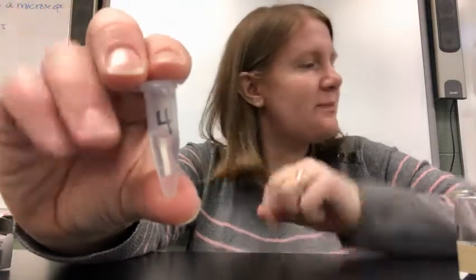Put a little bit of the sample in there. Get some of the testing solution. And invert the test tube. And there are the results for suspect 4.